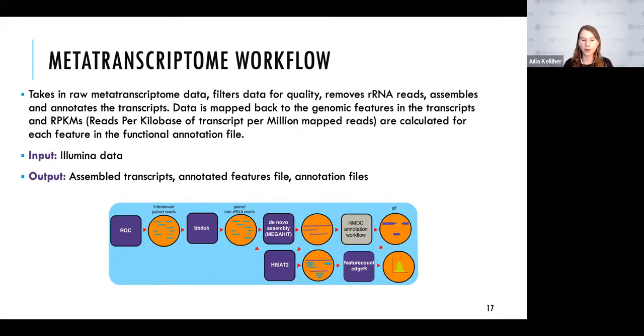And then these I will briefly walk through. So we're done with the metagenomic workflow, and I'm going to just briefly touch upon the other workflows. The metatranscriptome and the natural organic matter, the next 2 that I'll talk about, are available in NMDC EDGE. So I'll just talk about them a little bit and I'll show them to you in NMDC EDGE, but I'll just briefly walk through them since we won't be doing any actual hands-on work with these workflows.